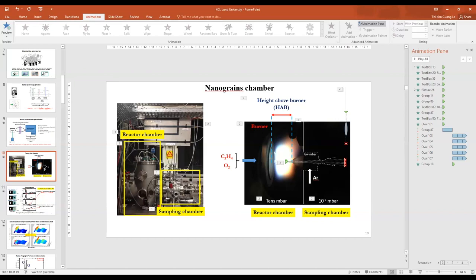Nice to see you. I was wondering, have you ever tried to study the influence of heteroatoms on soot? For example, nitrogen. In some fuels, like plastics or coal or biomass, there is, for example, nitrogen or phosphorus. Have you ever tried to study if these atoms may have an influence on soot formation and how they can?